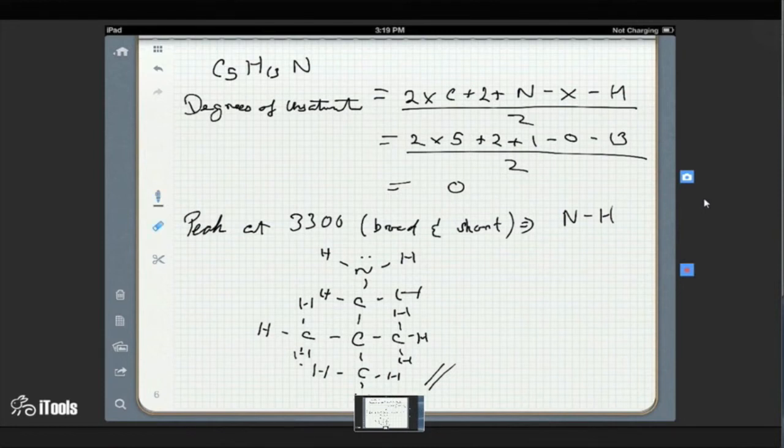It's a singlet. It's a singlet, and does that match your picture? Yeah, because the carbon that they're attached to has no hydrogens. So that's a good match. Now I see there's two 2H signals. Which of those do you think is the hydrogens on the nitrogen?